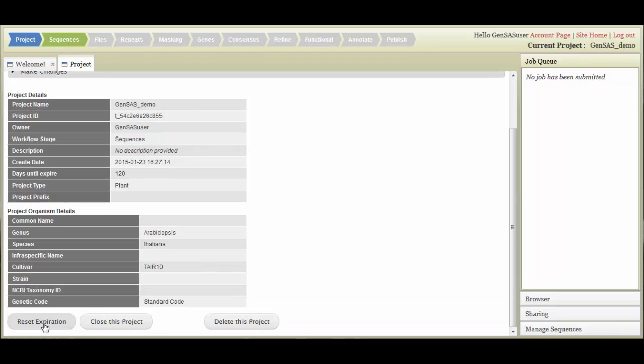Please note the Reset Expiration button on the project summary. All GenSaaS projects have a 120-day expiration. When the expiration date nears, GenSaaS will send you a reminder email, and you can log in and reset the expiration date, if you would like to keep the project.